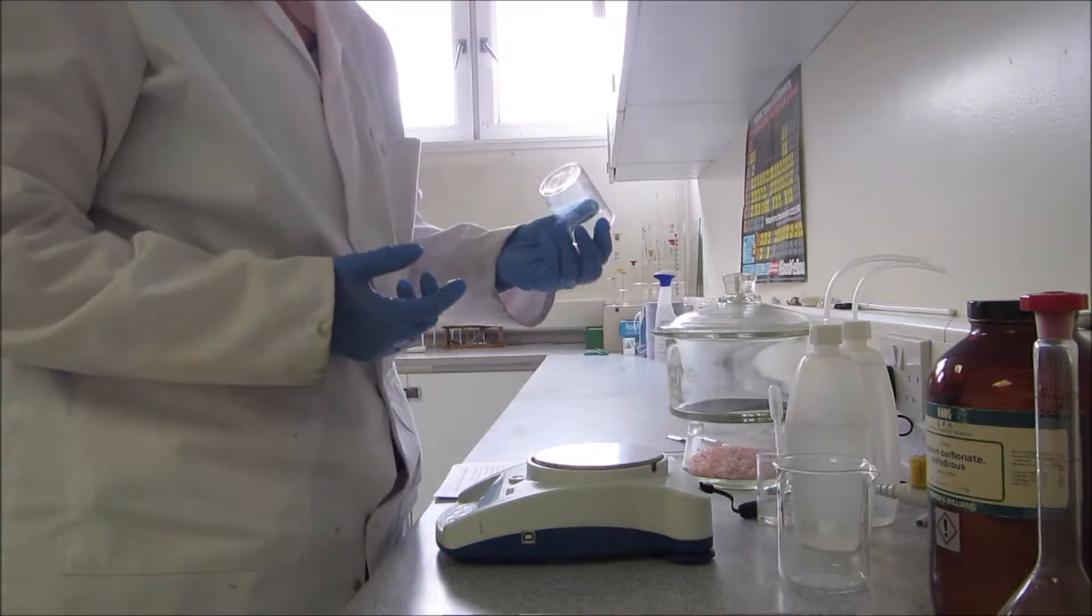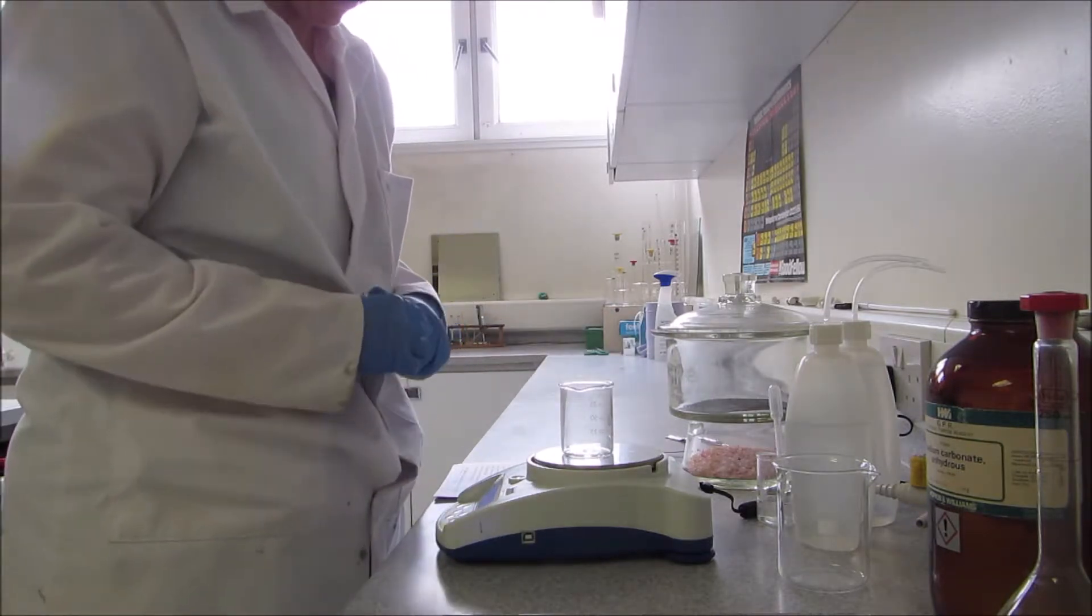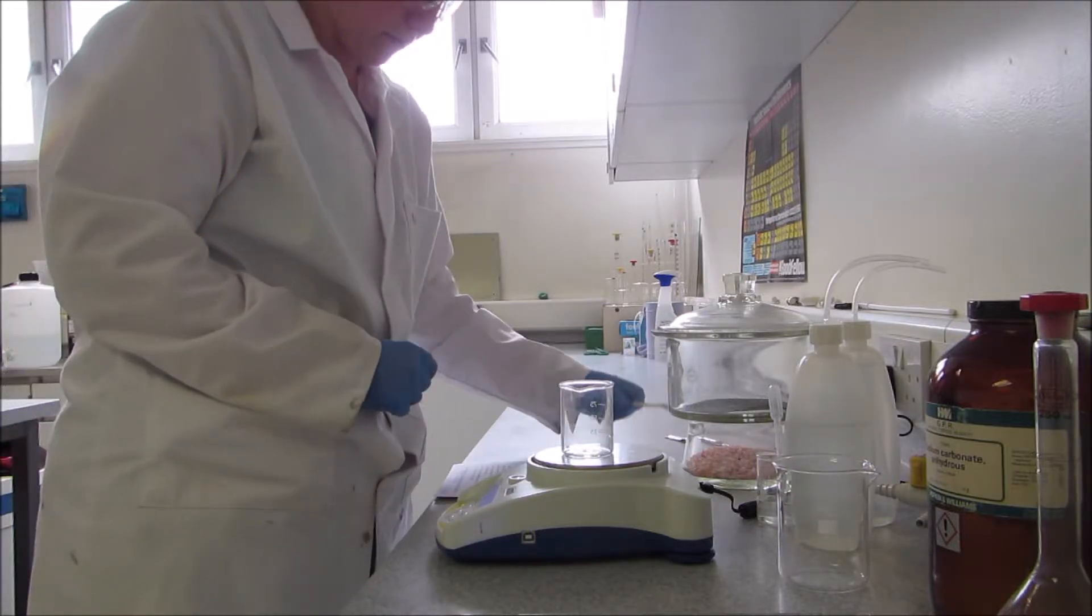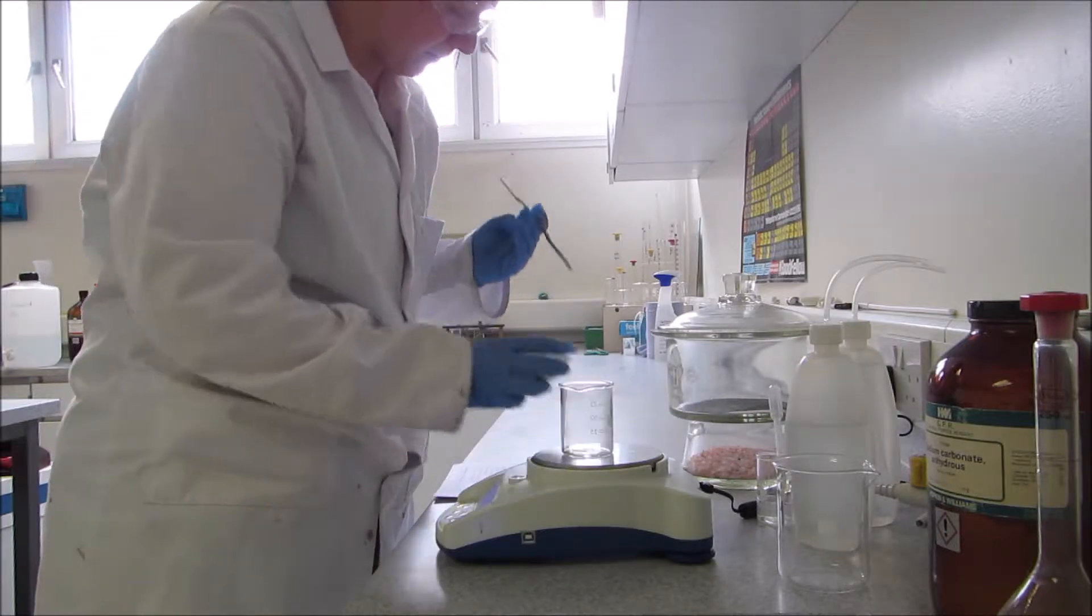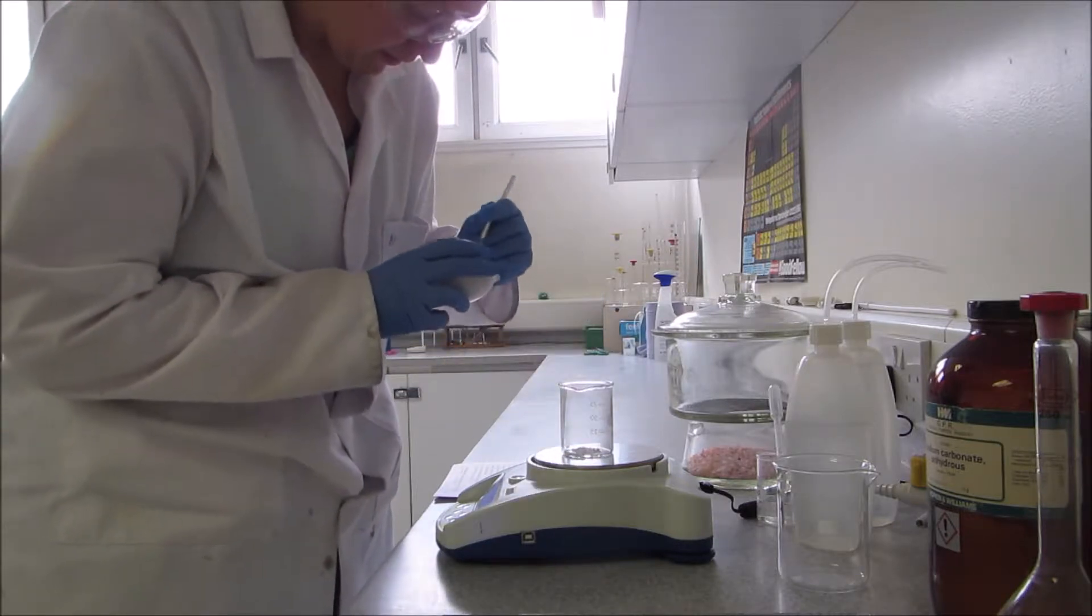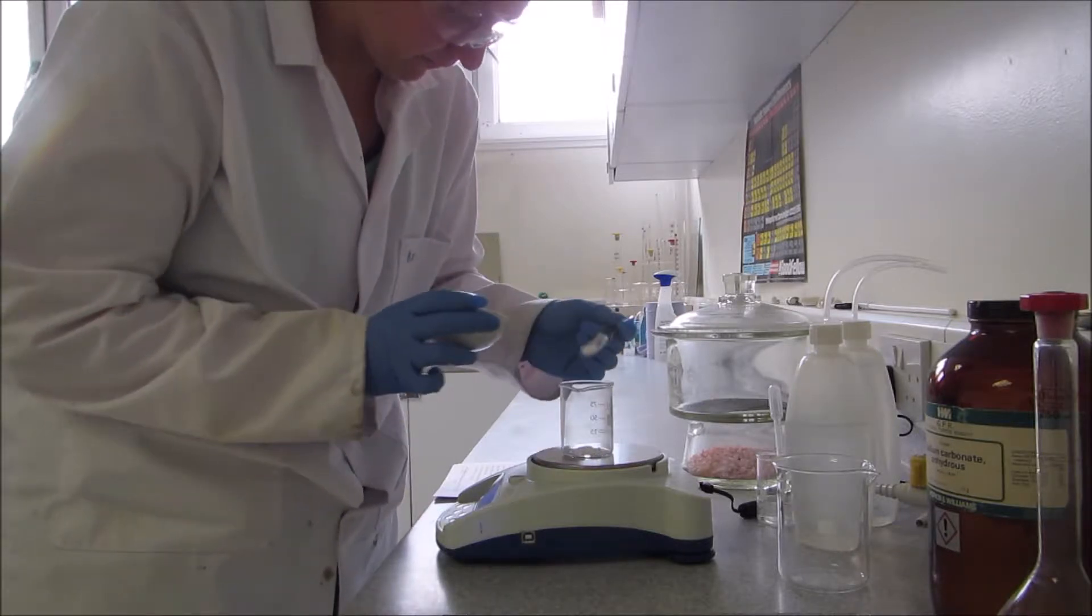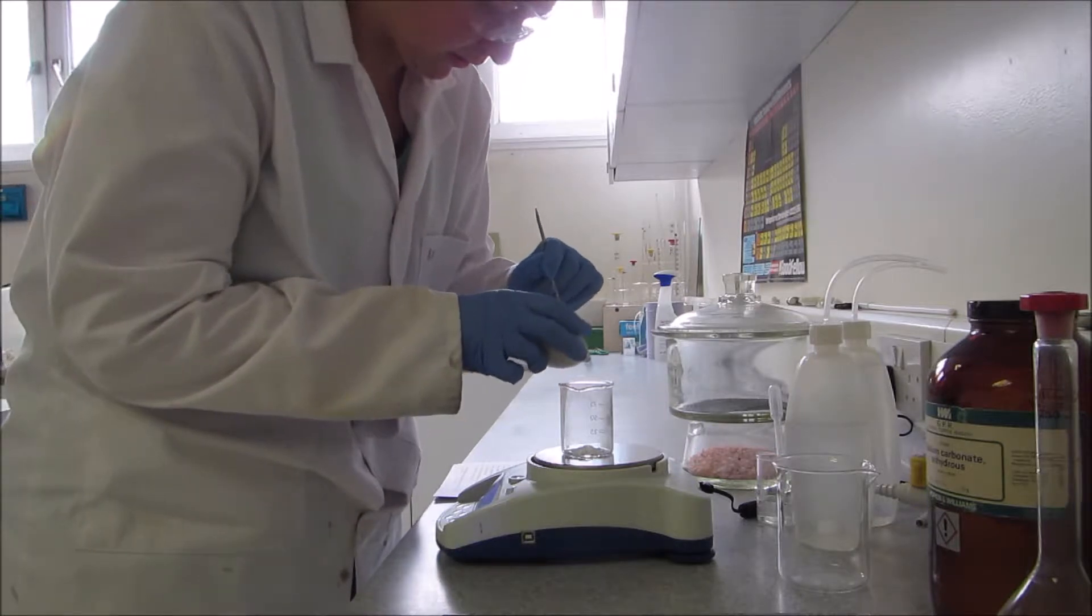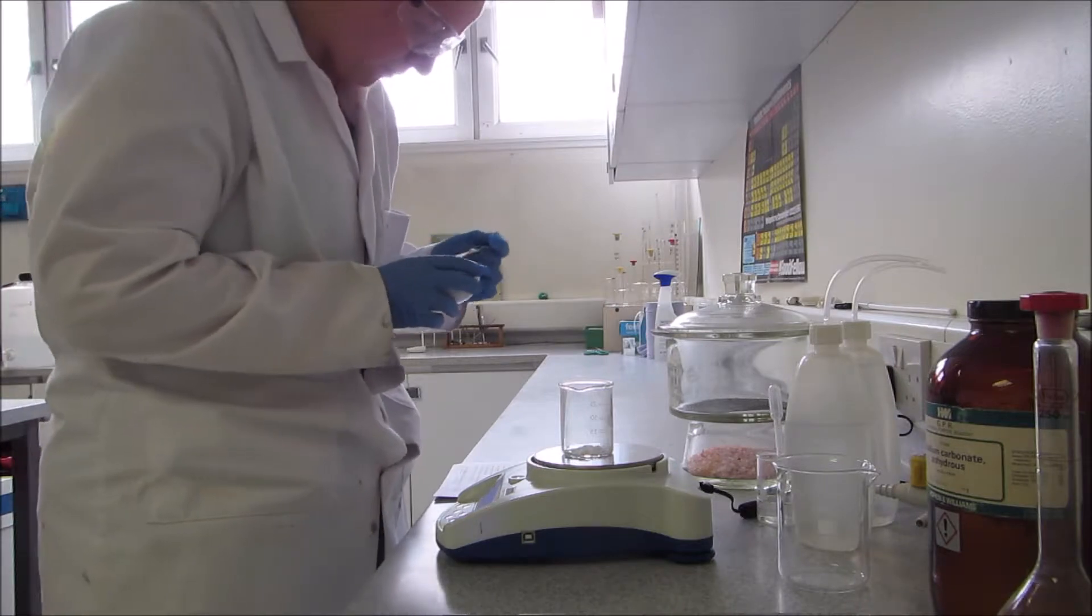The first vessel I'm going to measure into is the small beaker here. So if I put that on the scales and I tare it, I'm going to want to measure somewhere between 1.2 and 1.4 grams of sodium carbonate. 1.2 exactly.